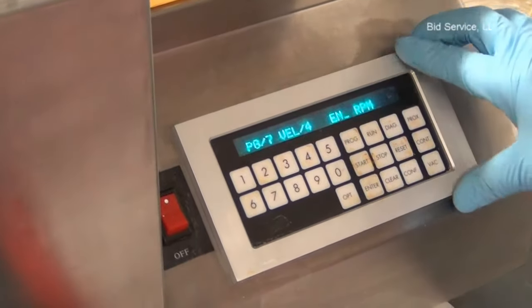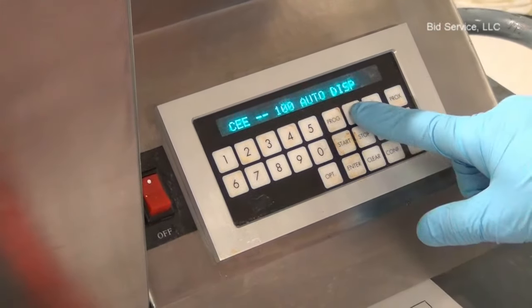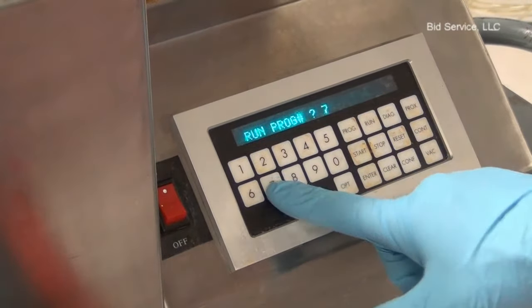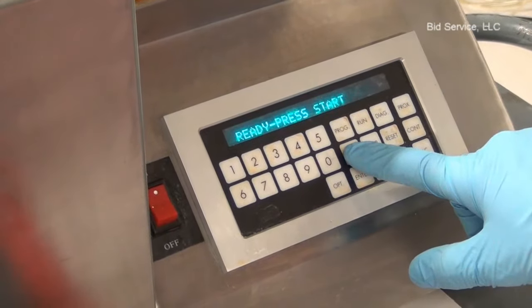This is the last step. Once all the parameters are entered, press the run button and select the program number. Press enter to start the recipe, and the start button is to start.